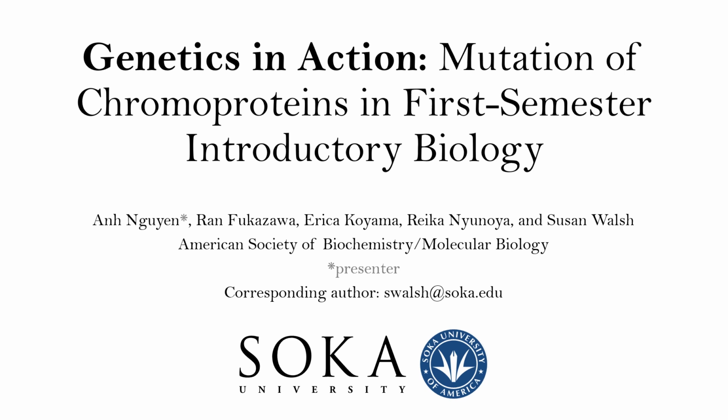I am a first-year student at Soka University of America. I am presenting to you a research on genetics. This was done as a part of an introductory biology class in my first year. Me and my classmates have done this over a course of 8 weeks with the help of our professor. Our goal is to discover the effects of certain mutations on chromoproteins color expression.